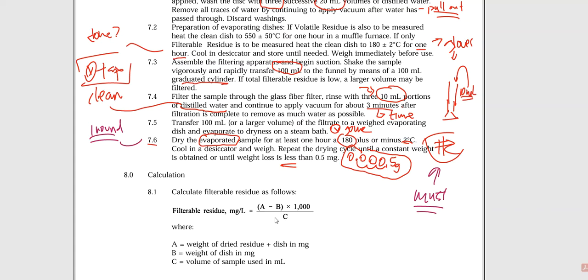Now, if we have the time, we might squeeze it in. But most of the time, it's just us giving you the idea of the process that has to happen, and then you walking away understanding that you repeat that process time and time again until you get a constant number, because that is what this method asks for, and that is what we need to be generating. So multiple heating rounds will always be required. Always, always, always. You've got to do this at least twice.